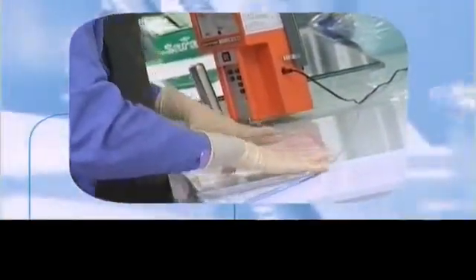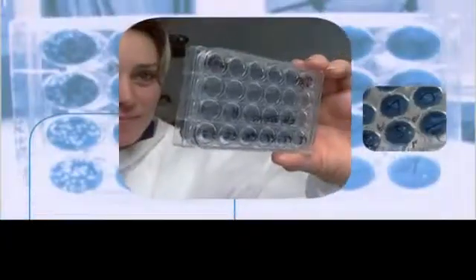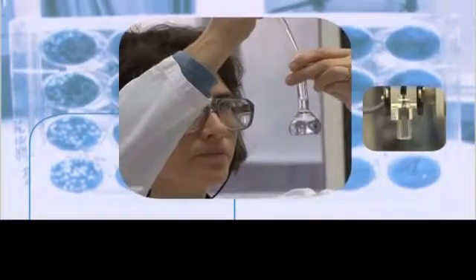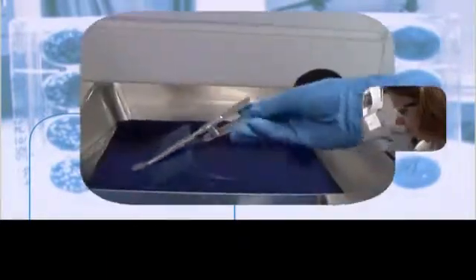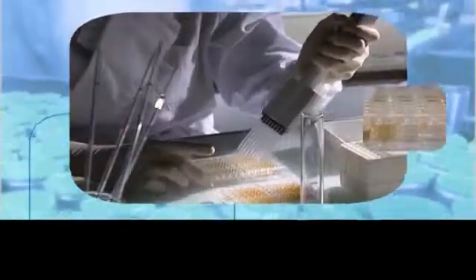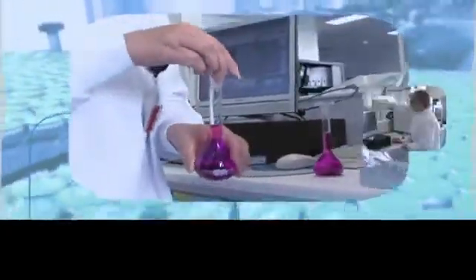Each and every batch of vaccine that is manufactured must undergo routine testing to ensure purity, efficacy, microbiological security and safety. There are no exceptions. If a batch does not meet the quality criteria, it will not be distributed. For some vaccines, more than 50 different tests may be carried out at various stages of production. As the batches come out of production, samples are taken from each batch and sent to the health authorities. These samples undergo another series of tests. Only after the vaccines have successfully passed all these tests can distribution begin.